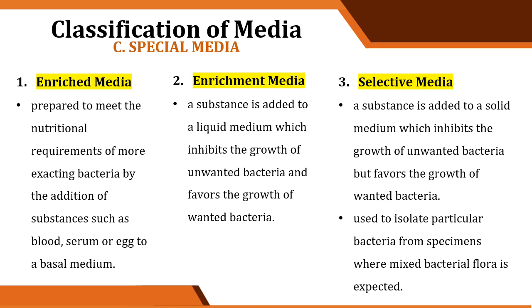Number 2 is enrichment media. Enrichment is when a substance is added to a liquid medium which inhibits the growth of unwanted bacteria and favors the growth of wanted bacteria. So, in enrichment, we added an ingredient that inhibits the growth of unwanted bacteria and favors the growth of wanted bacteria.